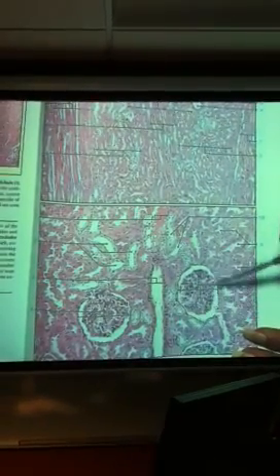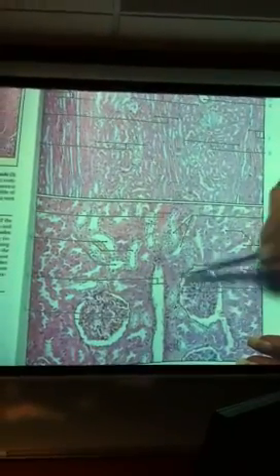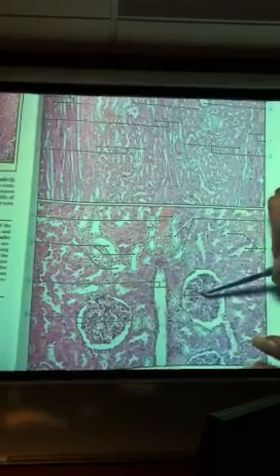So the open space is Bowman's capsule, the inside is the glomerulus, and the whole structure as a whole is the renal corpuscle.